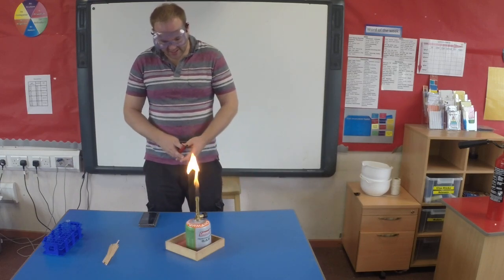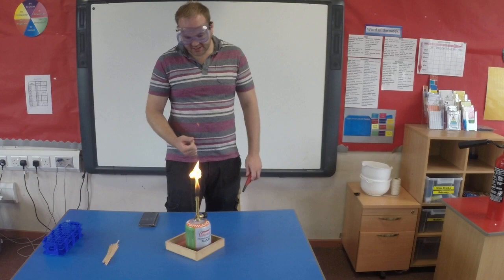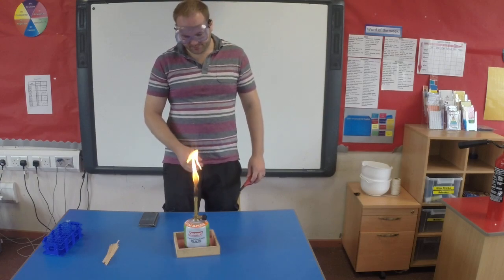So we've got a nice yellow flame there. That's our safety flame. So whenever we're not actually doing something on a high heat, we would have this valve closed, and that's our safety flame there.